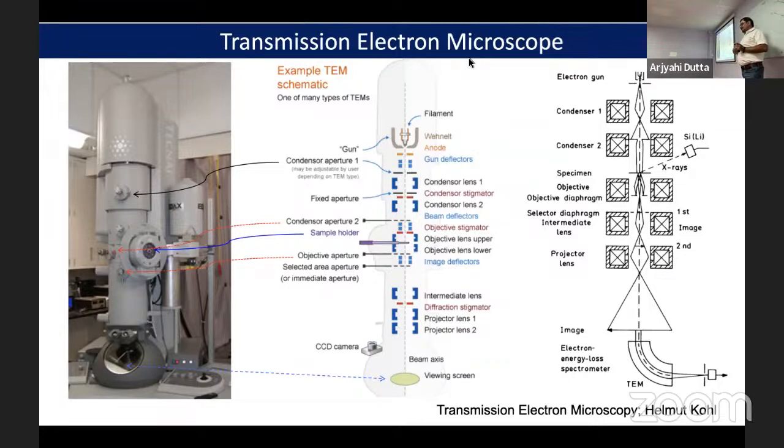Cannot? Why not? What aberration? Aberration will be there. That is correct. Definitely, there are 2-3 types of aberration. But with aberration, we can also image, right? Even in the electron microscope, all the aberrations are there. But why can we not do it? That is my question.